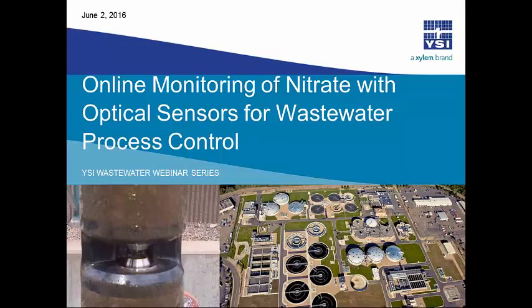The topics we'll cover will include measurement principles of optical sensors, the design features of an optical sensor, applications of customers who have used optical sensors for nitrate monitoring, and then we'll also compare and contrast optical nitrate sensors with the alternative ion selective electrode nitrate sensors.